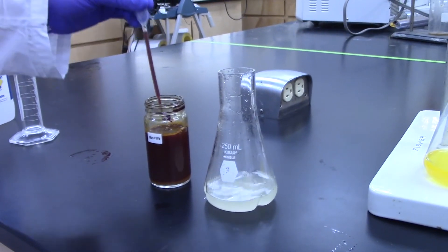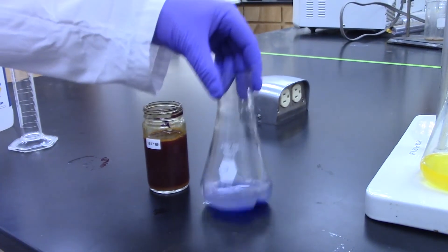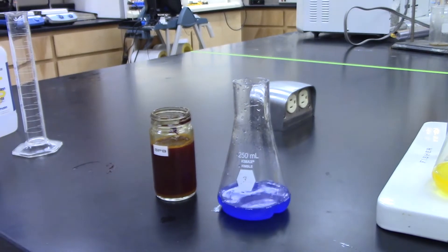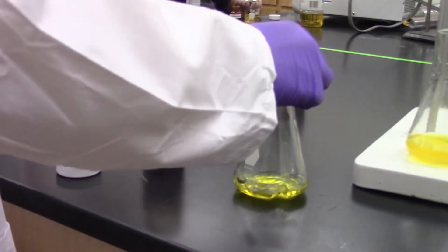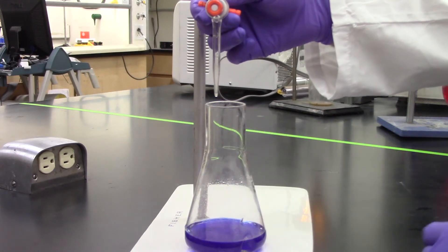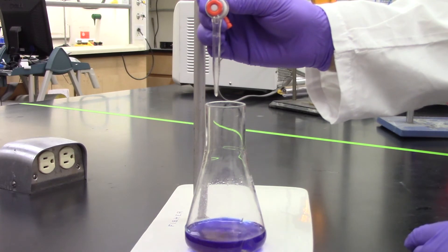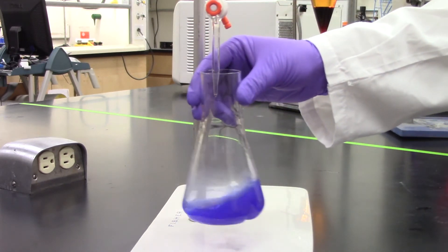Next, add 1 milliliter of bromophenol blue indicator. This indicator changes from blue to yellow at a pH of 4.5. If the indicator goes directly to yellow when added, the sample is free of soap. Titrate with 0.1 or 0.01 normal hydrochloric acid, depending on the amount of soap expected, until the indicator changes from blue to yellow.